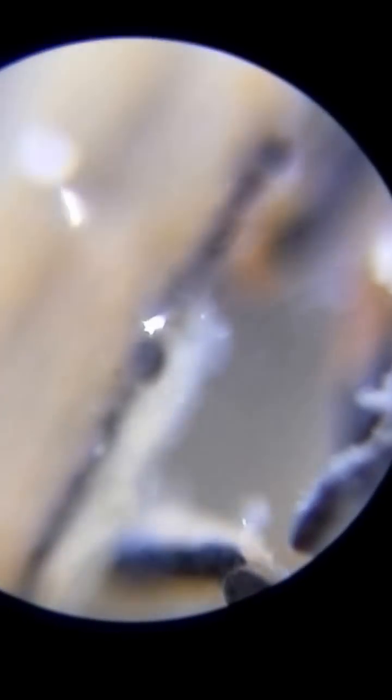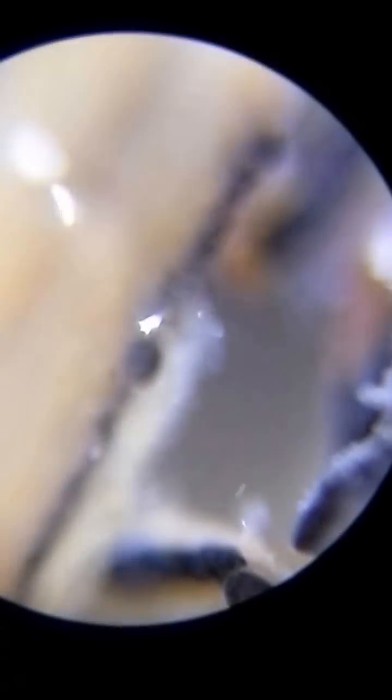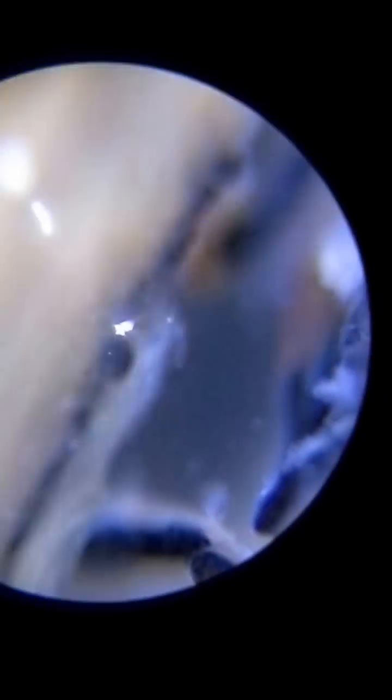That's backwards movement for a scope. See stuff floating around in there? I see these little suckers. Looks like little Filaria. You see them moving.